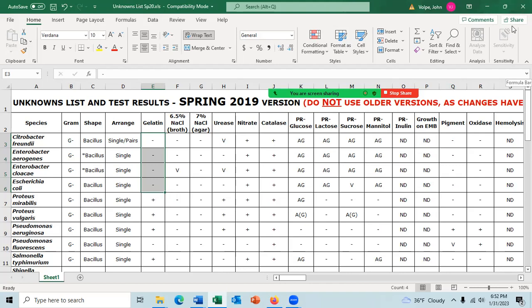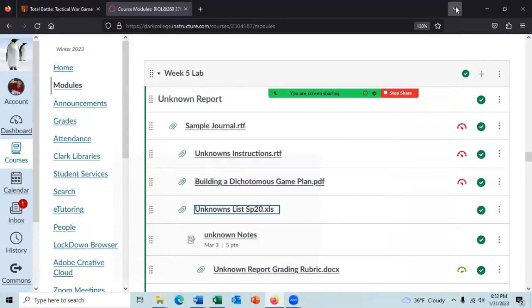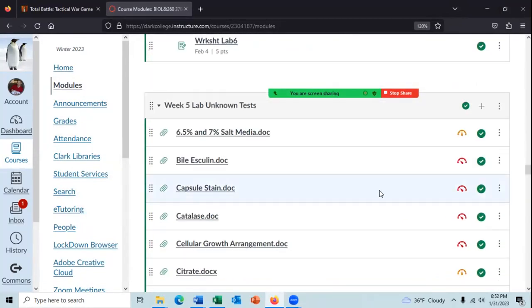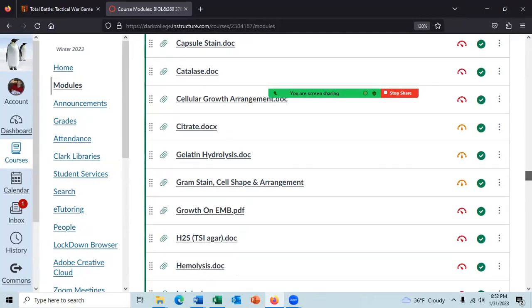Okay, thank you. And can you find out more information about each of those tests by coming here? Let me see if I've got that on. Hopefully I do. Yeah, I do. So here are all the tests you can run, and it'll tell you more about each of the tests. And you should read the test before you decide to run it. And certainly after you ask it, you should read about the test.